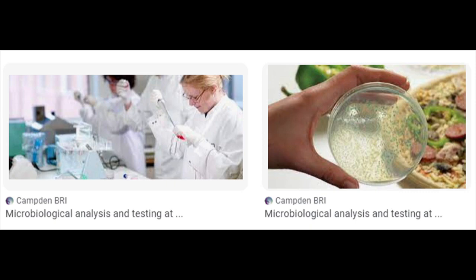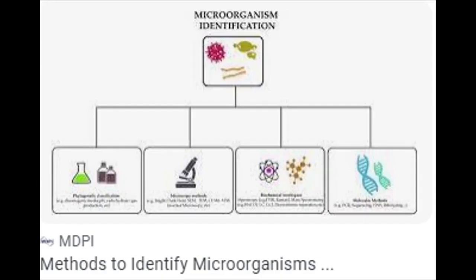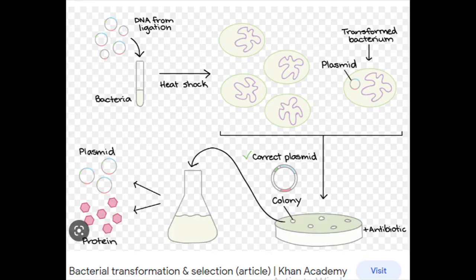We have Erwinia, Escherichia, Klebsiella and many others that are predominantly fecal in origin. Then we have another group usually detected in the coliform test: Citrobacter, Enterobacter, E. coli and Klebsiella are detected.